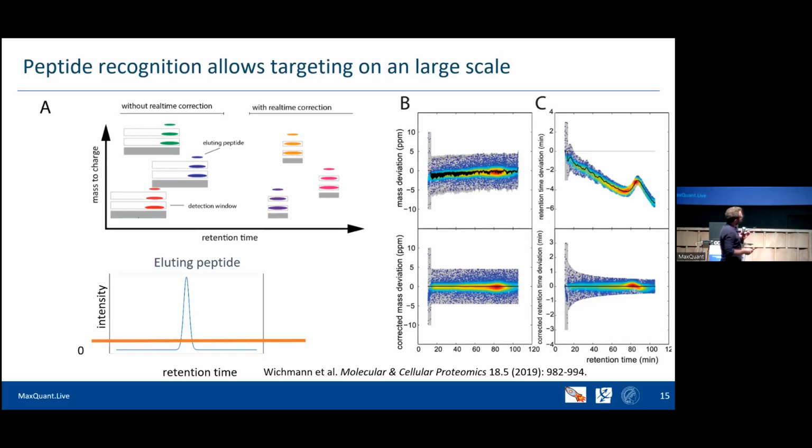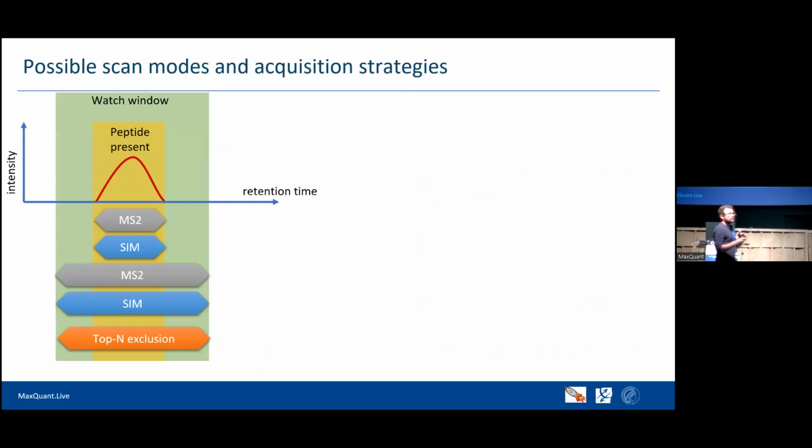And you can see here, right, when we apply this correction, they are mostly eluting how we predicted in real time with the software tool. And this gray area shows the window size for the retention time, which is then shrinking, and this is automatically adjusted. The same applies for the mass deviations. They're also corrected out in real time. So this is the underlying algorithm for the correction, and it's kind of useful. And you can do a lot of stuff with it.